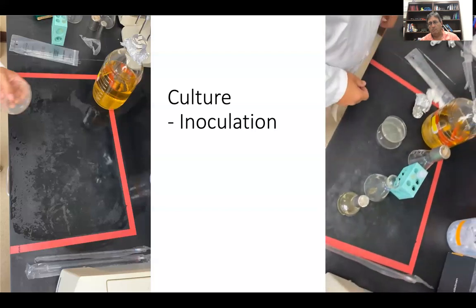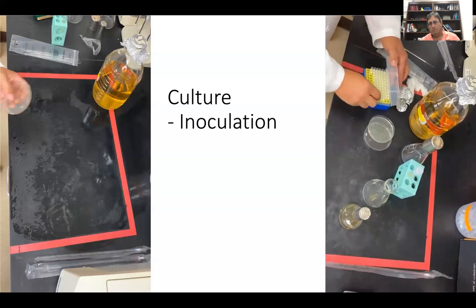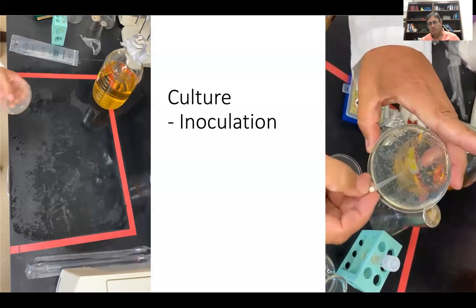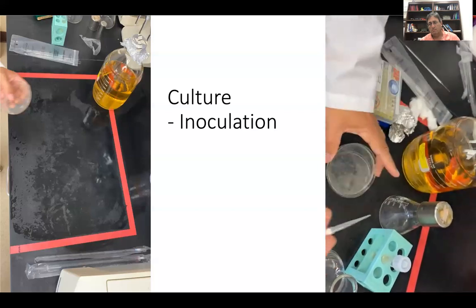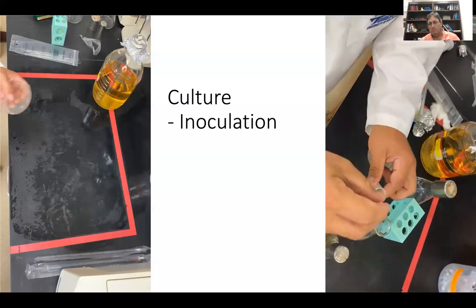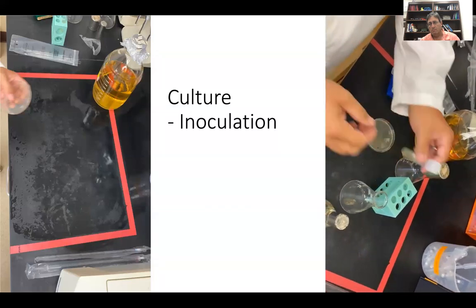We'll do this again in another way. Sometimes take a pipette tip and find an isolated colony. Just scrape that colony up. You don't need to get all of it. Place it in the cap. I like to just leave the tip in there.